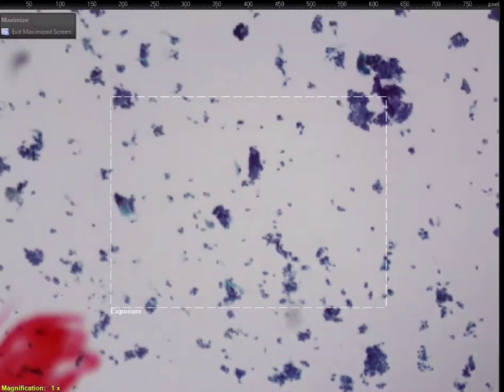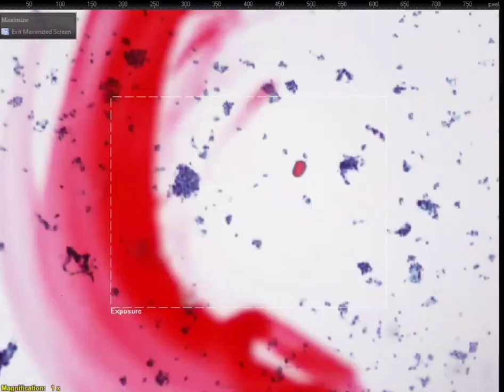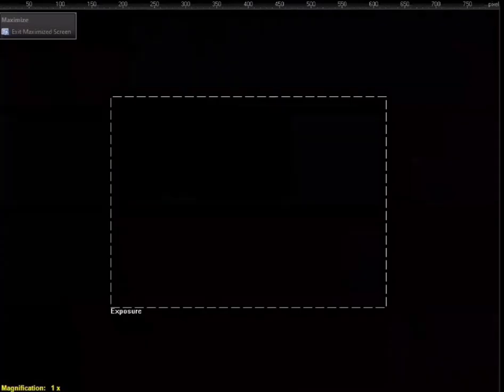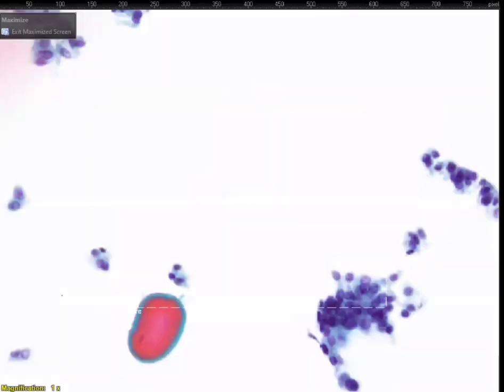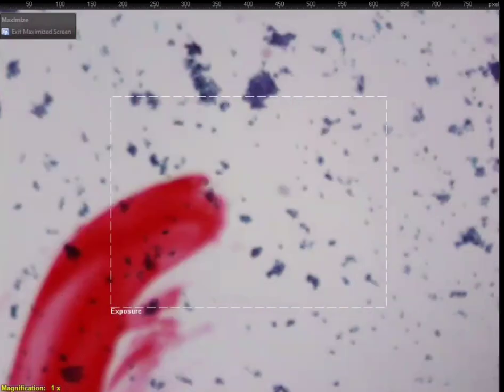Yes, and a very good point that Dr. Mushtaba made as well is the lymph nodes near the thyroid. Okay, very good. Nice. That was easy. Fast. Oh, look, what's this? What's this pink thing? The colloid. Nice little blob of colloid. Thick colloid. No cracking, but it's colloid. Yeah, excellent.